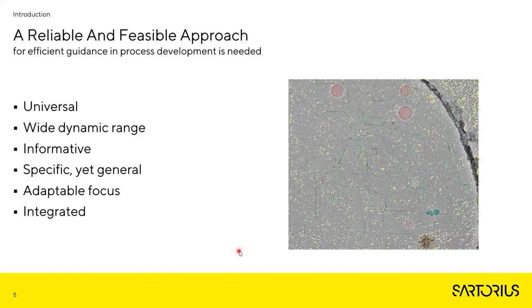So it would need to have a wide dynamic range to give as many different perspectives to the sample as possible, be specific, but at the same time tell us a general integrated picture about the sample.